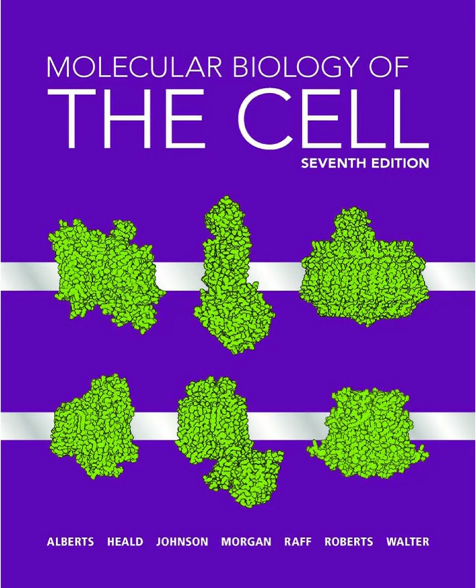But there's that trade-off again, isn't there? You're only seeing the labeled bits. The rest of the cell is invisible. That's a key limitation of fixation and staining, yes. You lose the dynamic context, and you only see what you specifically labeled, which leads us to GFP.